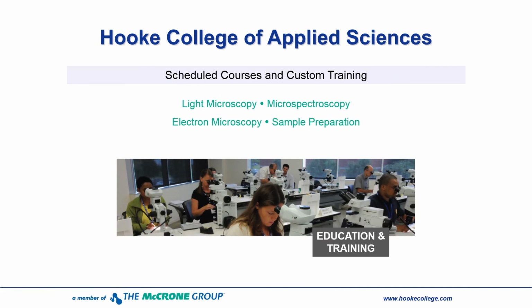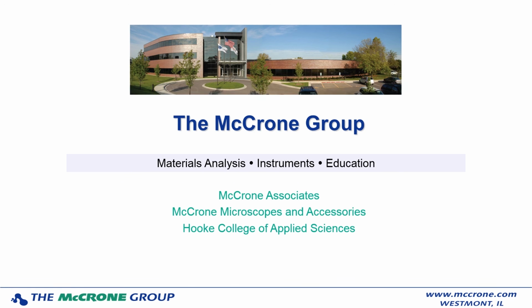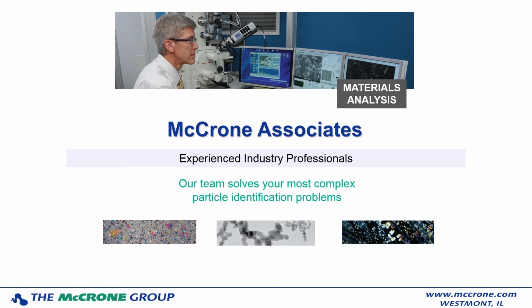Can the Nomarski be retrofit to a standard light microscope? I guess it depends on the microscope. If the Nomarski accessories are available for it, you'd have to check with the microscope manufacturer. But certainly it can. It's going to have to be a compound microscope, though, not a stereo microscope. The name of the last book you mentioned was the ASM Metals Handbook, Volume 7.